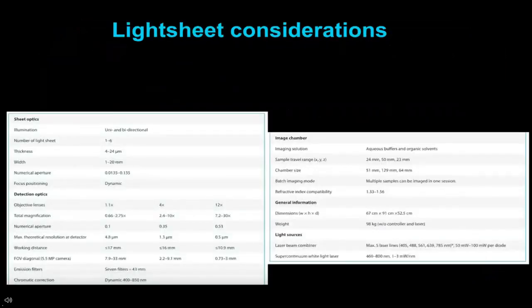And now to some considerations. If you want to get into light sheet microscopy, we'll go through some specifications here and some considerations. First, the size of the sample.